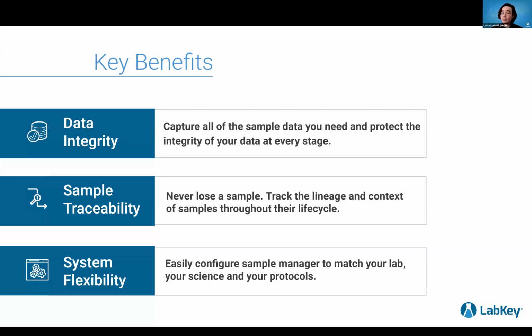We also have a very robust audit log for our samples, and that kind of leads into sample traceability. So we can track all the changes that have been made to your samples, but you can also track exactly where your samples are in storage, where they came from, and where they are in their life cycle. Then there's our system flexibility. We want to make sure that Sample Manager adapts to the way you work and you don't adapt the way you work to Sample Manager.